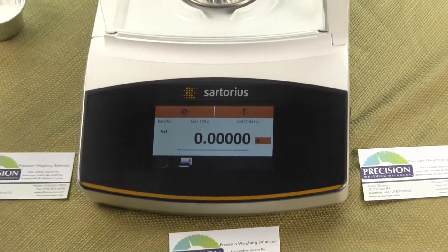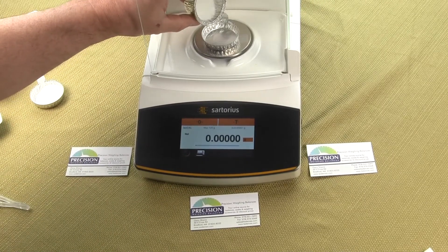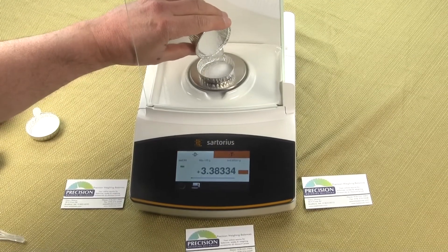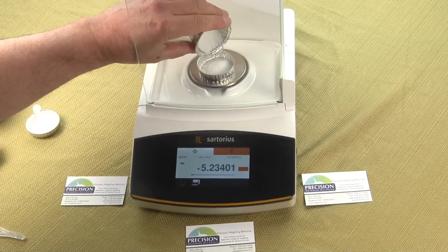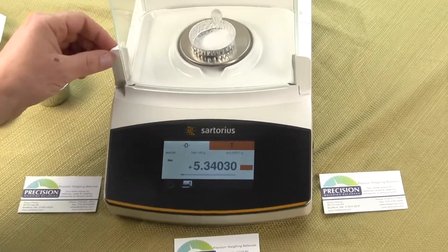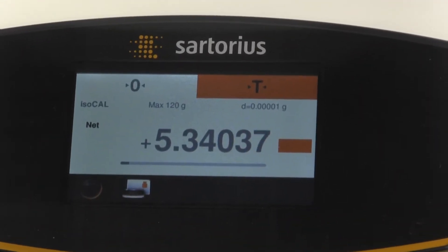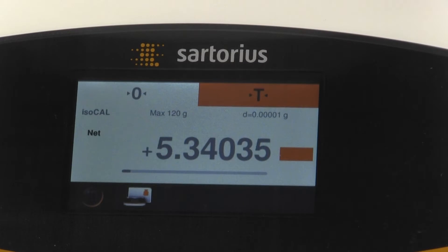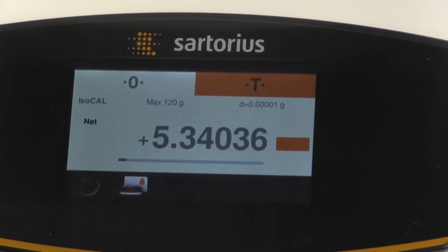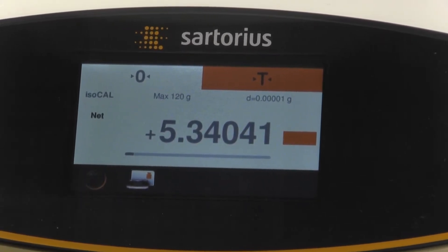Then we can go ahead and place a sample — this is just table salt that we're pouring on the balance, and you can see the balance responds to the weight. We can close the door. Now since we've tared out the container, we'll have the weight of the salt that was added. Once we get a bold font, that's telling us that we have a stable reading.